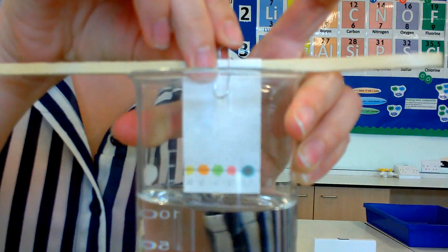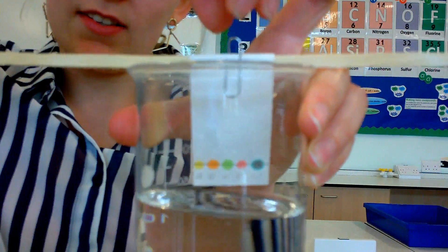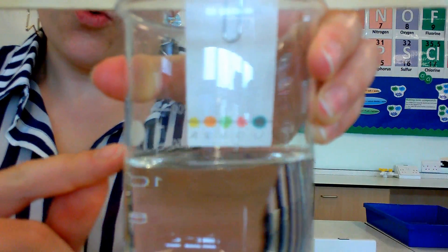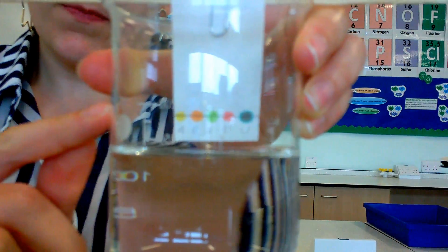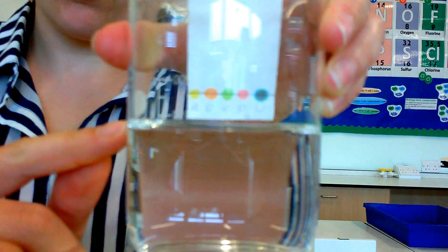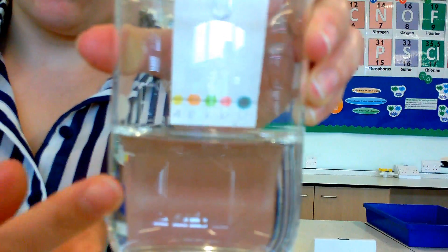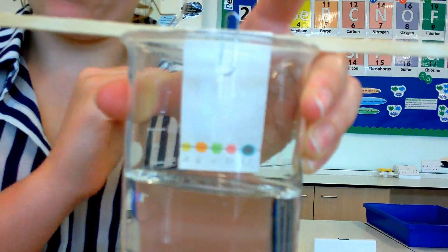I need a couple of drops more water in here. Have a pipette of water on hand so you can add just a little bit. The water must not go up to the level of the inks - the paper should just dip into the water. If you put the inks in the water, they'll just dissolve into the water and the whole practical will be ruined.